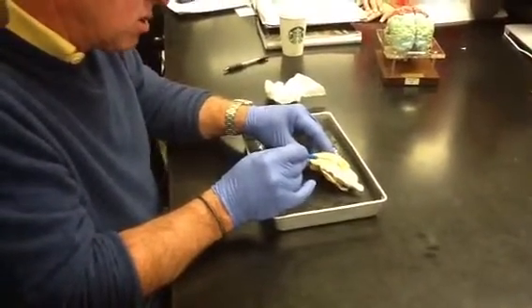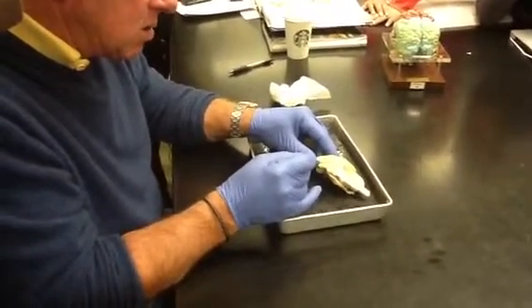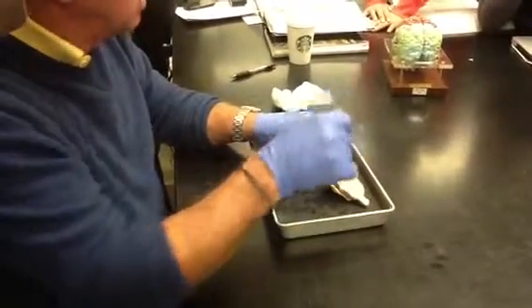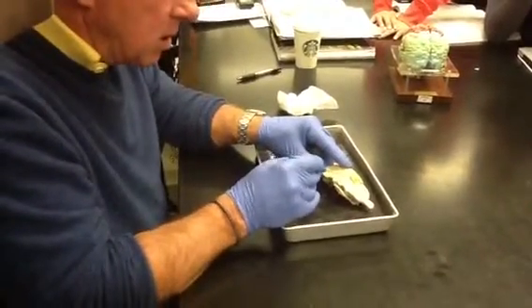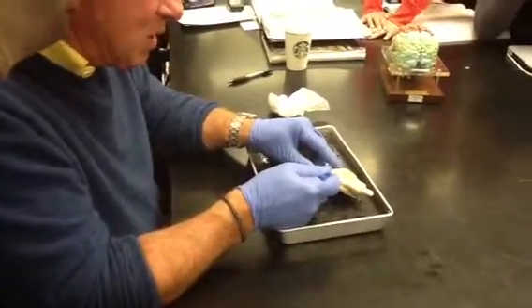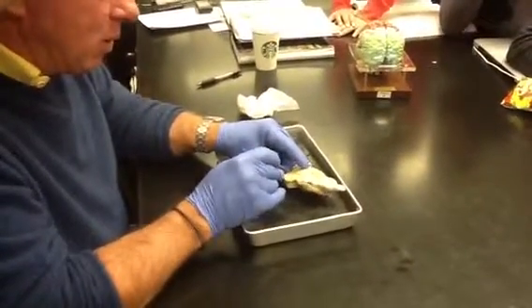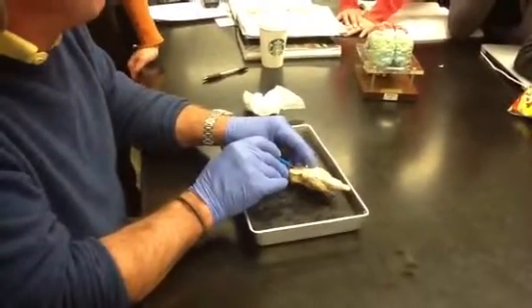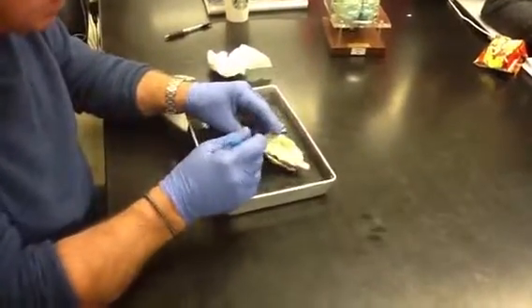The structure right here, this white matter, is the corpus callosum. That's the major connection in all animals between the right and left side of the brain. And then there's a little thin curtain of tissue, it's really hard to see, which covers this surface here. It's called the septum pellucidum. And if you open it up like this and pull this back, you can see there's a space in there. That's the lateral ventricle. So the septum pellucidum is a little curtain that covers over the lateral ventricle.